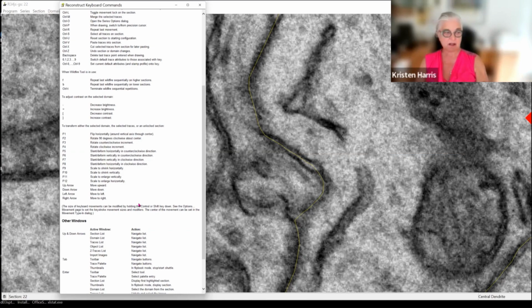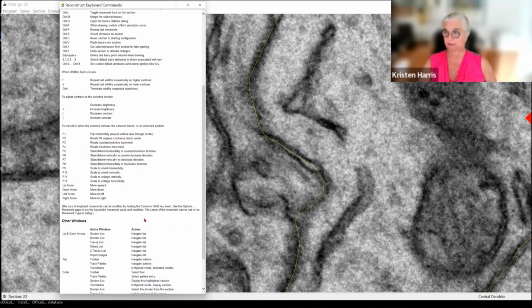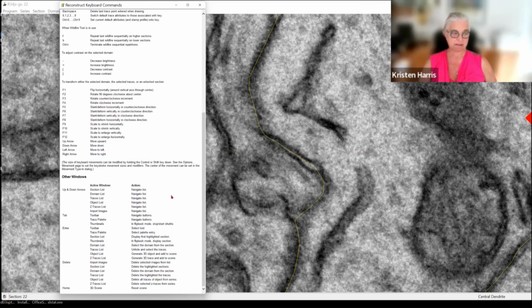So all of this component of these tools has to do with alignment and transformation to be able to do the alignment. However, it's useful to still have up and down and right and left movement around in the images, which you guys do already. So I think that's a whole area that's not really needed.